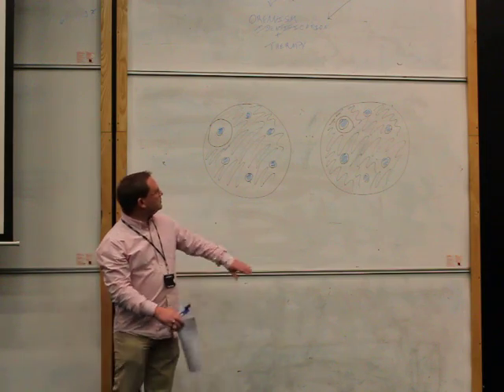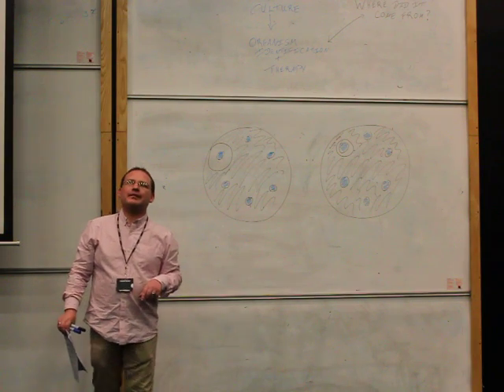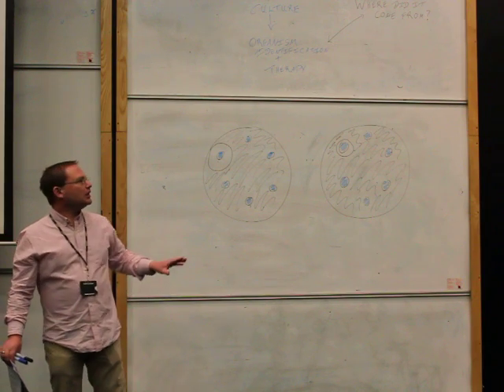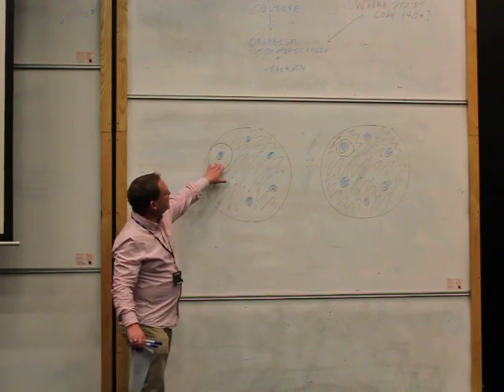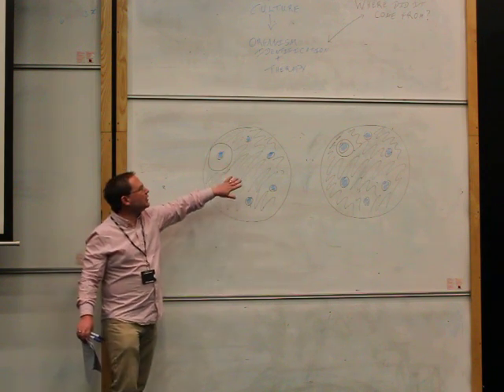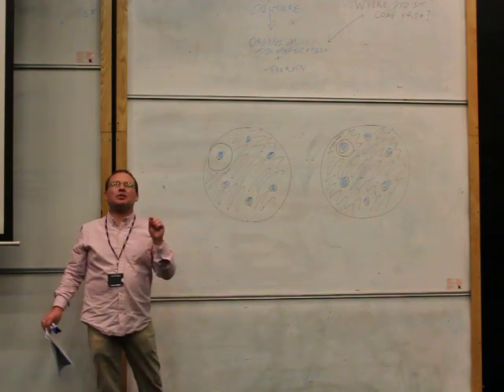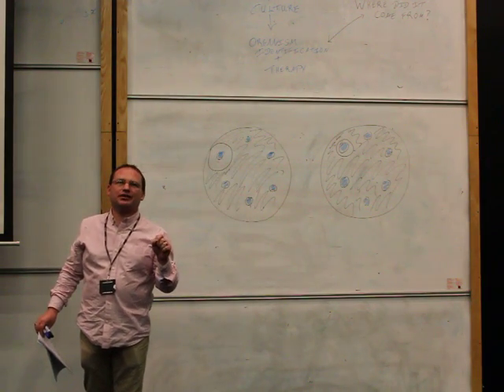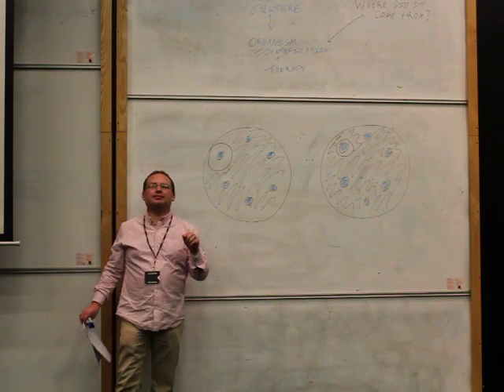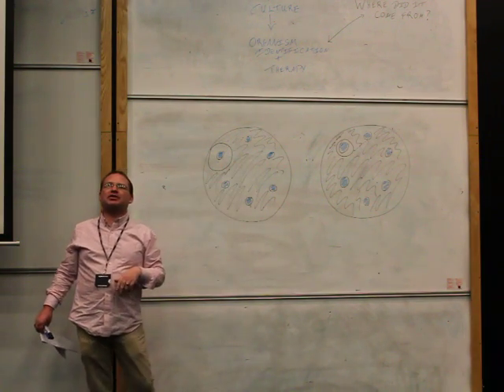Now, we have a control organism here. It has a known antibiotic susceptibility pattern. So in this case, we know that it is sensitive to this antibiotic. We also know, therefore, that this zone of inhibition, the area where there is no bacterial growth, the size of which represents sensitive. So you need to measure the diameter of that zone of inhibition and record it.